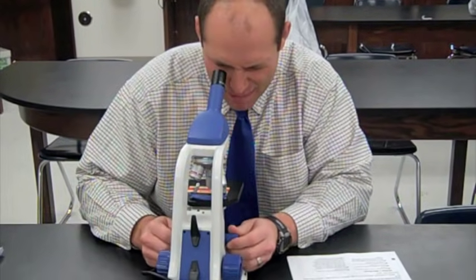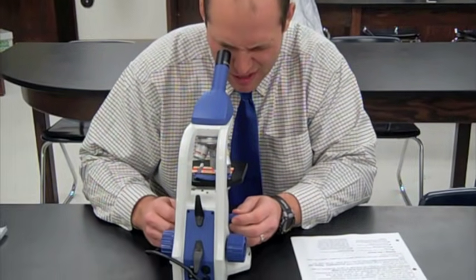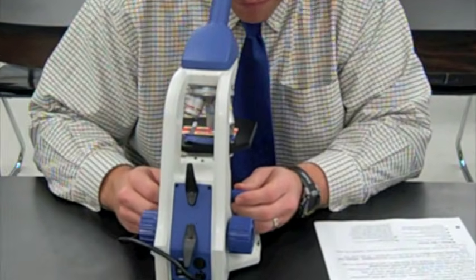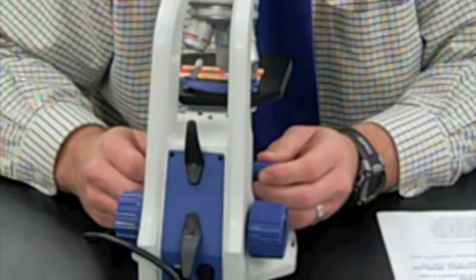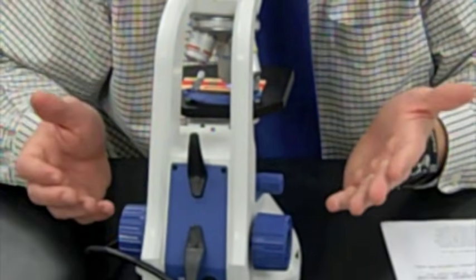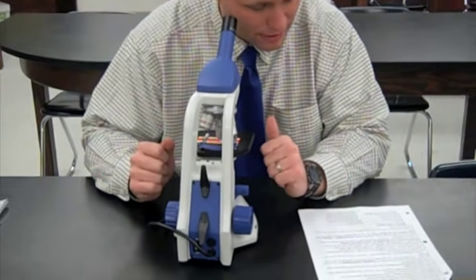Okay? Now when I begin to focus, I want to make sure that I focus with the fine adjustment only and get it to the point where it's as clear as you can make it. And I have it set ready to go right there. And now if I'm drawing this, I would usually just draw what I see right there in the viewing field, and the specimen should be filling the entire viewing field at this point.